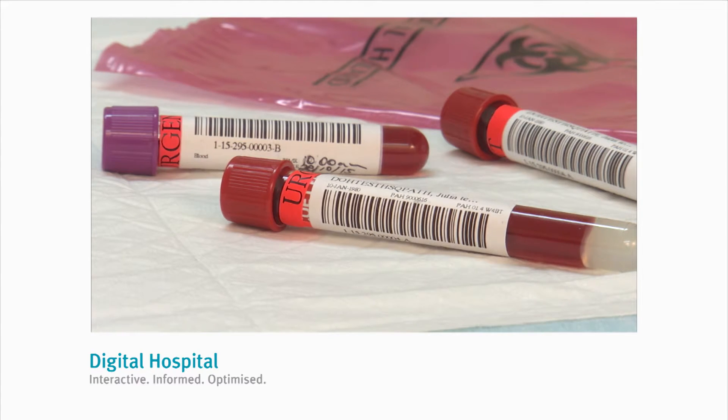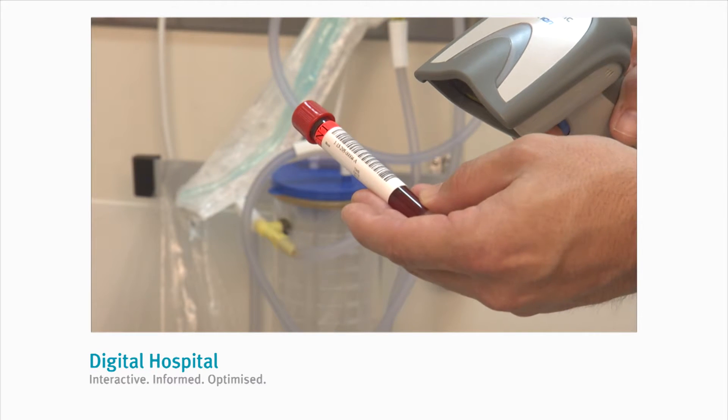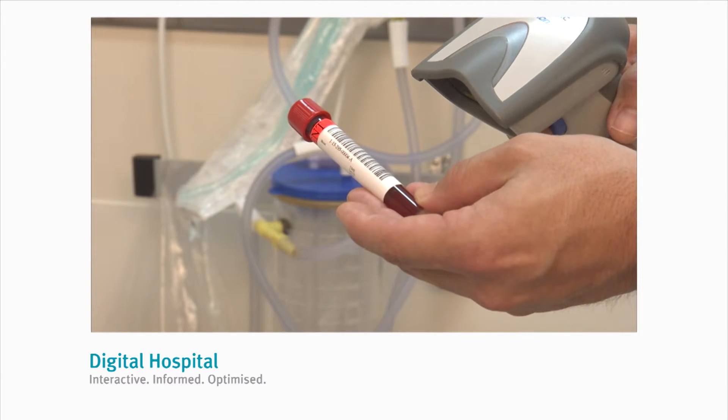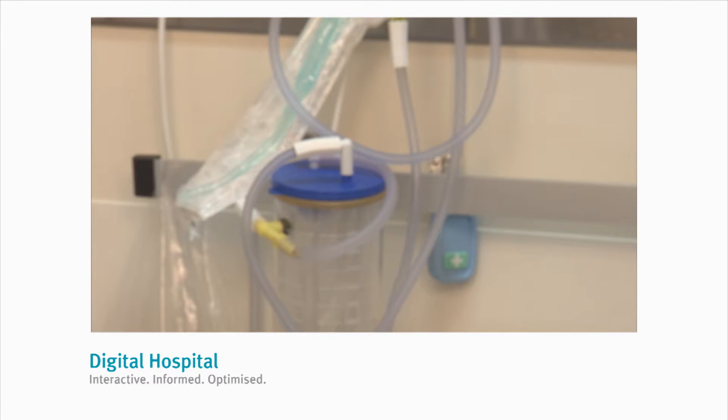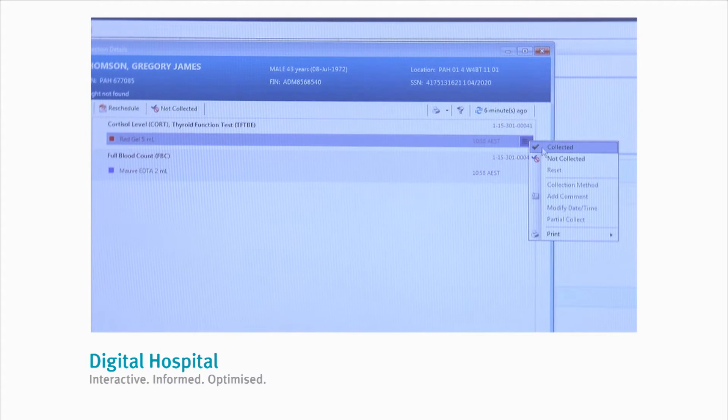Once you've collected the tubes and applied the labels, you can scan each tube with the barcode scanner, which will mark each container as collected in the system. If you don't have a barcode scanner, you can click on the drop-down box to the right of the container and mark each tube as collected manually.